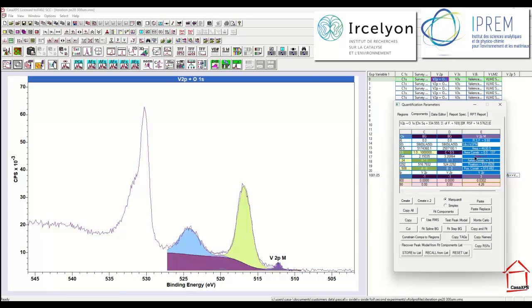And we can try and approximate this if we take the component that represents the metal and paste that component into the peak model, adding the prefix that turns this into a Shirley background, and let's try and add to the intensity of that background as if it is more than you might expect.